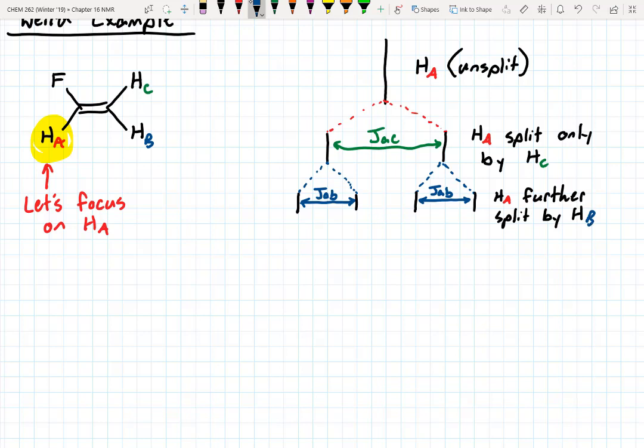Okay, so the weird thing is when we zoom in on what we would have thought would be a triplet, the peak looks a little bit different. Let me actually zoom in a bit more here. It's going to look like this, spread out like this.